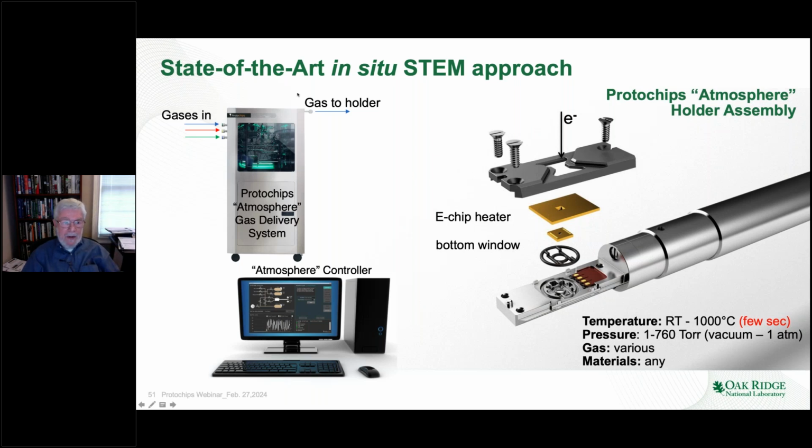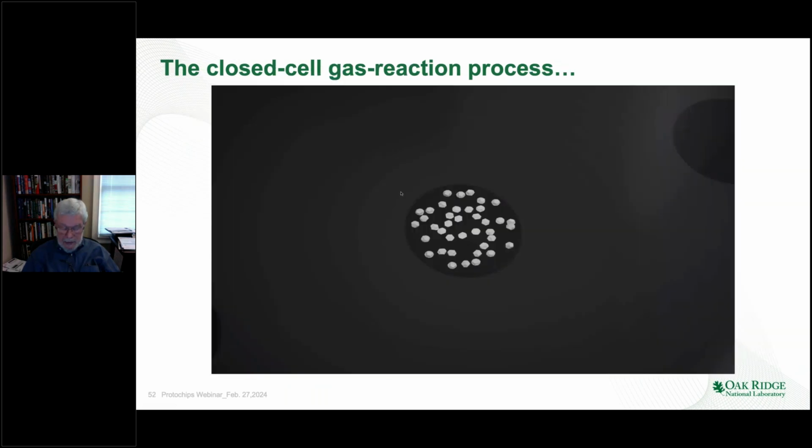But now we have a very sophisticated system with a manifold to control gases into a holder that has two chips that encapsulate the gas in between, and a sophisticated controller, the so-called atmosphere system, computer control for doing in situ studies. Kinga will show the CAD movie of how this all works, so I won't do that.